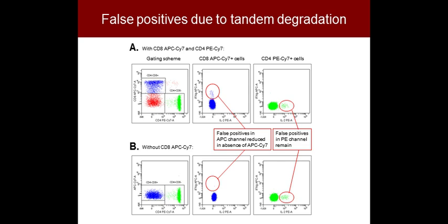So that's the worst case scenario, and because of the choices we made, trying to look at small populations that would be cytokine positive in the parental channels of these tandem dyes that we were using for bright and universal kinds of antigens like CD4 and CD8 was just not a good idea. So we rearranged our panel and put our cytokine antibodies elsewhere, our CD4 and CD8 not on these tandems.